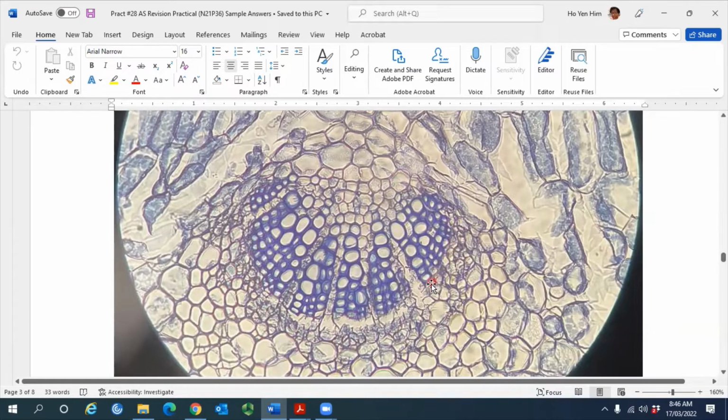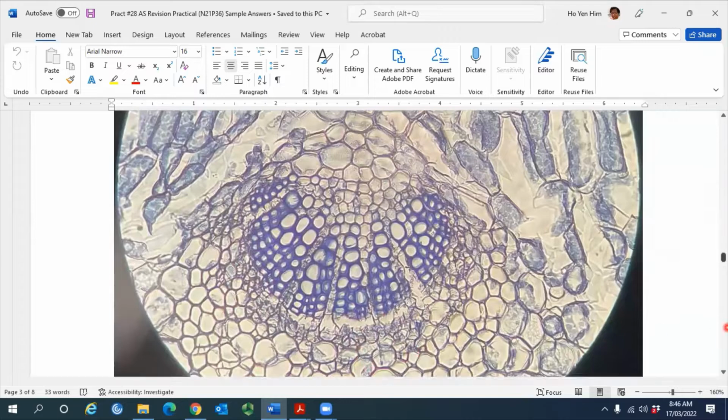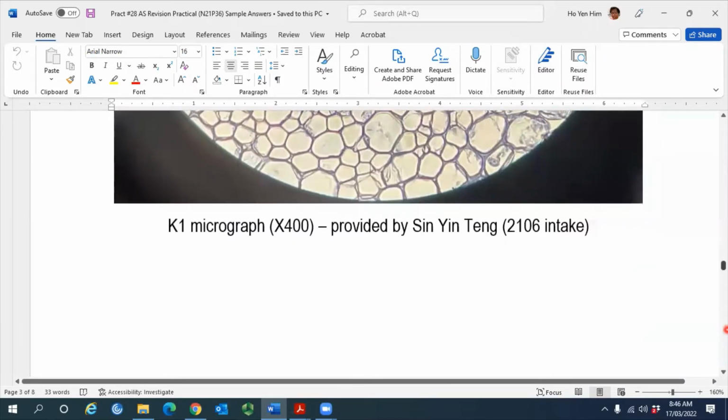So this is actually the cambium cell. Can you see here? 1, 2, 3, 3 of them here. Can see or not? This cambium cell, usually about 1, 2, or 3 layer of cells. So this is cambium. This part here tear away already, so you cannot see the cell. Okay, then this is the phloem already. Okay, all the way is phloem.